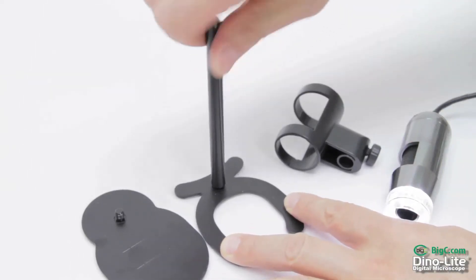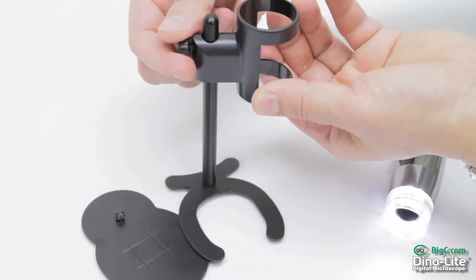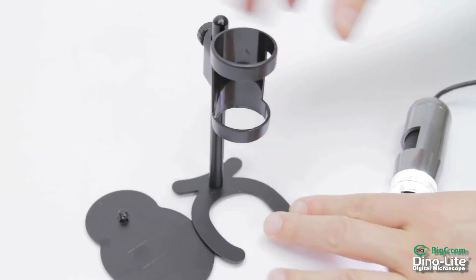Choose a base that best fits your needs, then screw the mounting pole into the base. Finally, slide the holster onto the pole and tighten your set screw.